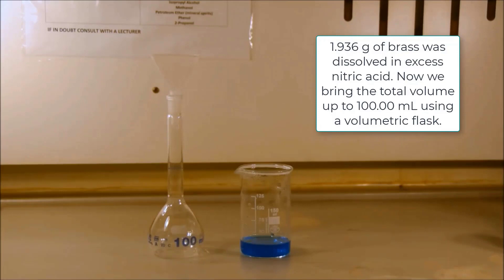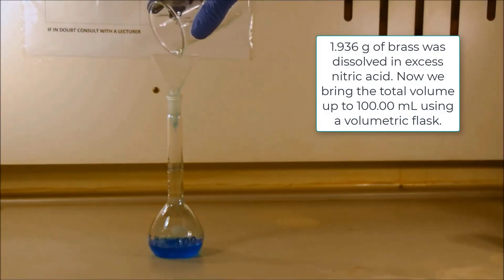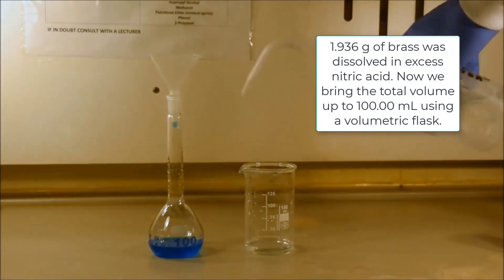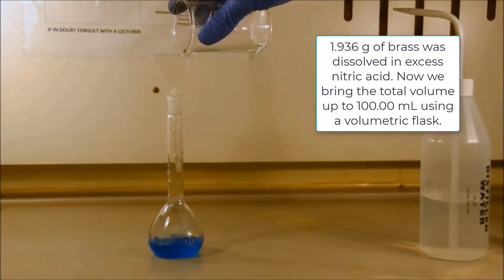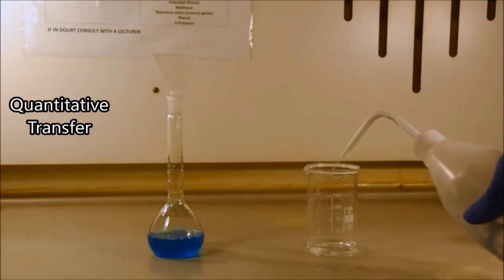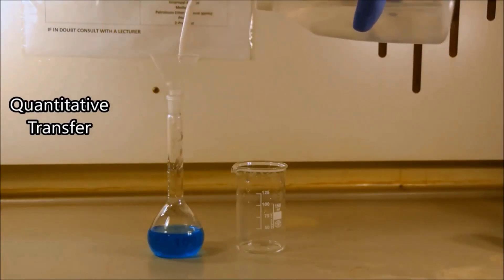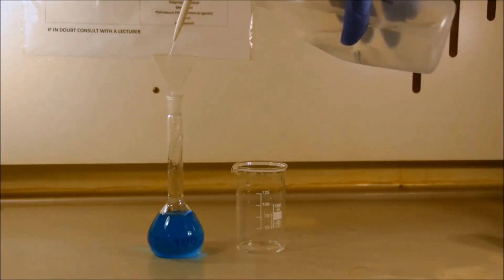Now I'm going to rinse down the sides of the beaker and transfer it into a 100 mL volumetric flask. I'm rinsing down the sides to make sure all of the dissolved brass ends up in my volumetric flask — this is a quantitative transfer. I'll rinse one more time, give the funnel a good rinse, and make sure everything is down in the bulb of the flask.